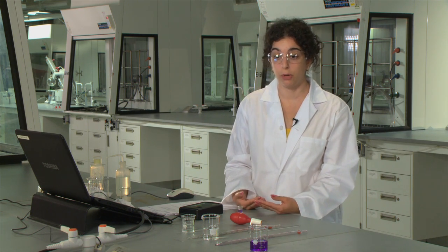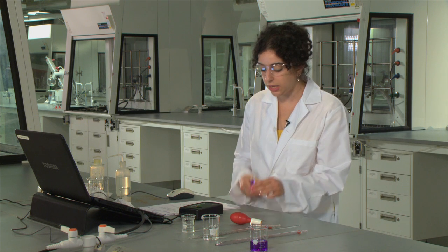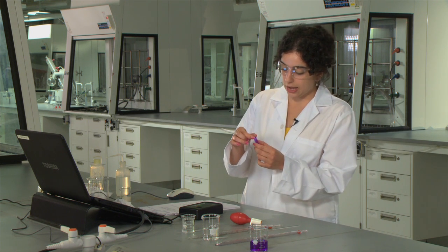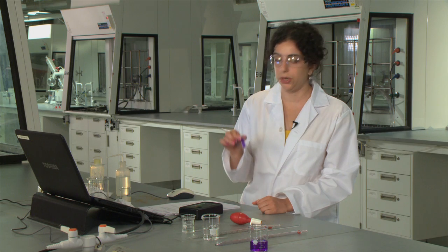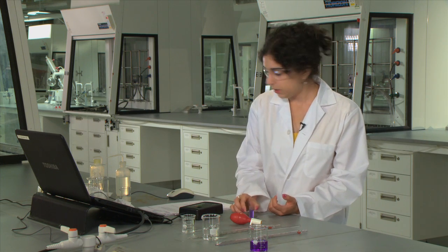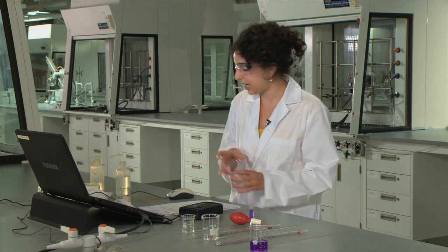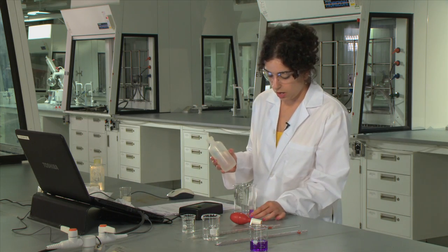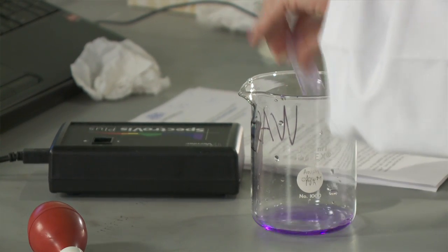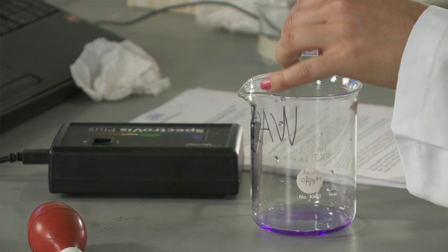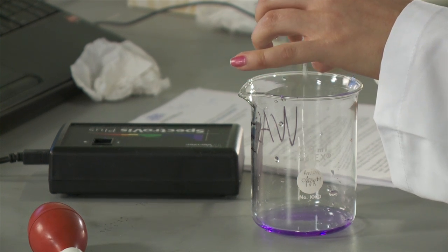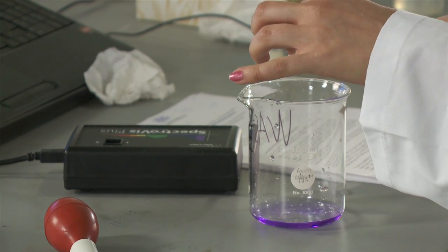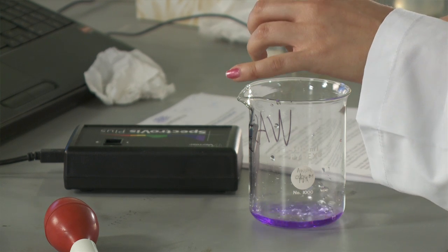Now we have to prepare our sample. Now since we just ran a spectra of crystal violet, we're going to need to rinse out the cell. So to do this, just take your wash bottle, dump your solution out in a waste beaker, and rinse out the cell with water.